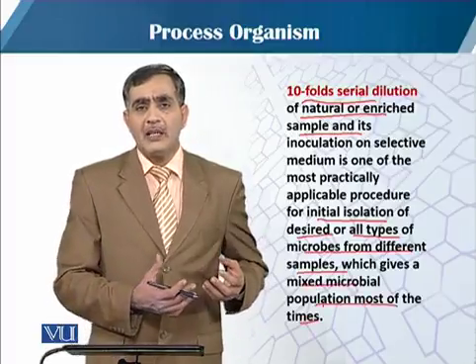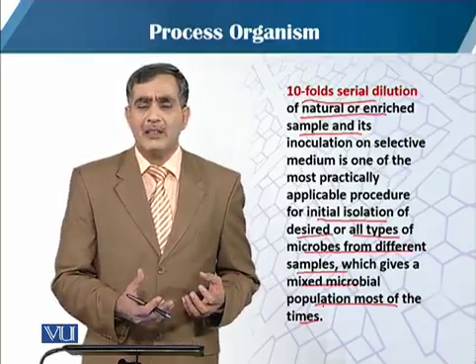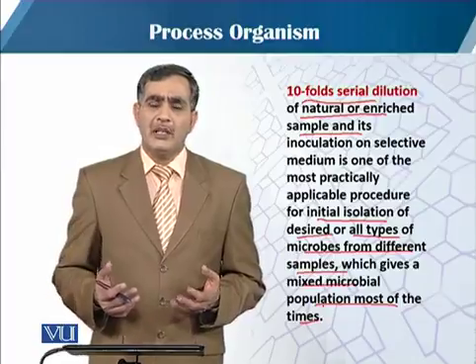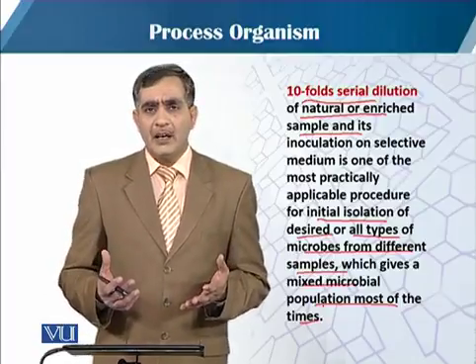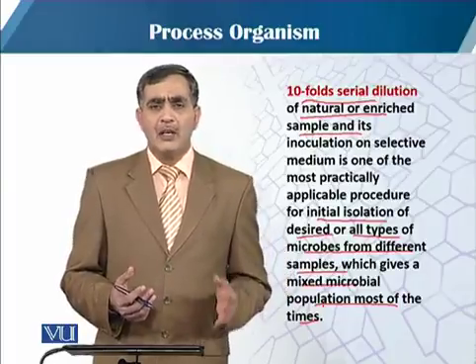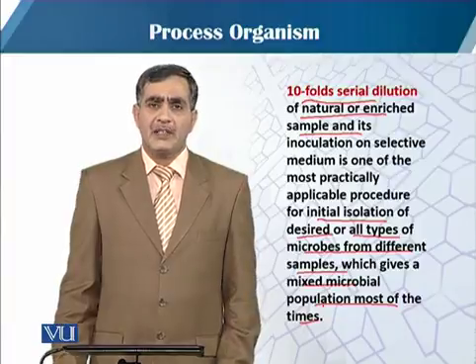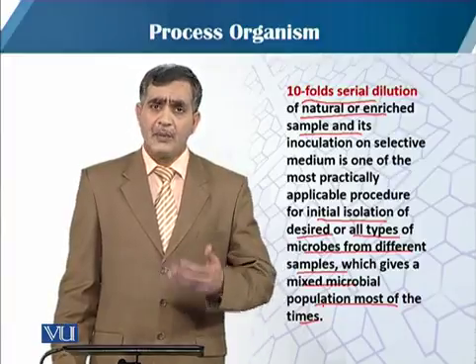So when we isolate, there is less chance of having a pure culture. If we have isolated colonies, then we can have a pure culture. Otherwise, first of all, we have to adopt the isolation process, followed by pure culturing of the microorganism.